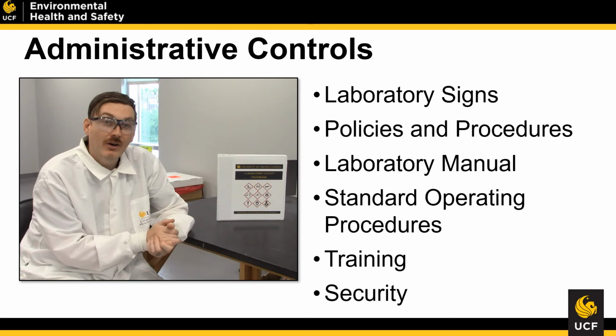The Environmental Health and Safety Department is here to assist you with all of your laboratory activities. We have experts across multiple subdisciplines, and our bread and butter is making sure that you stay safe and healthy. So please utilize our expertise and knowledge anytime. We are here to help.